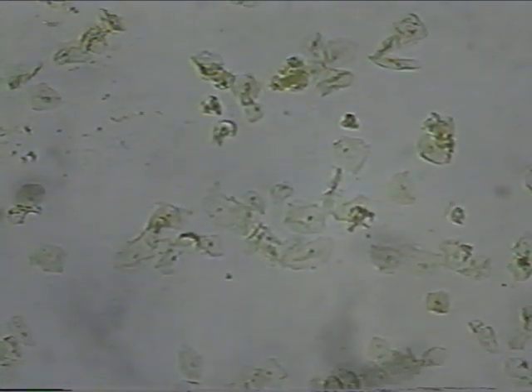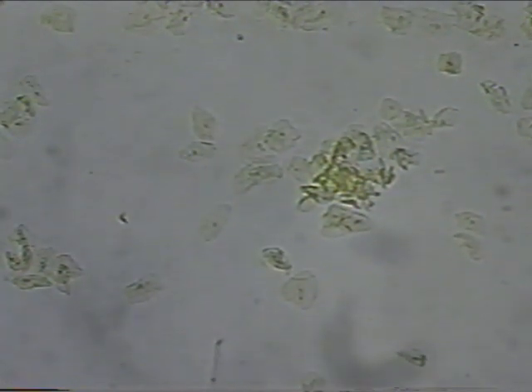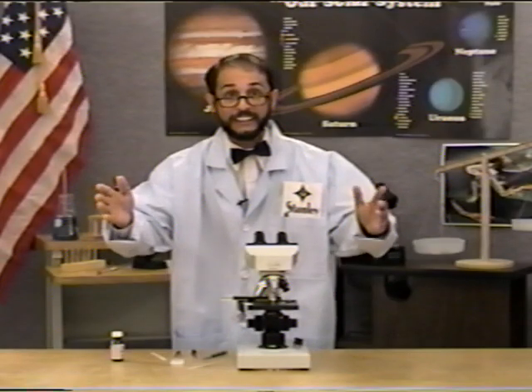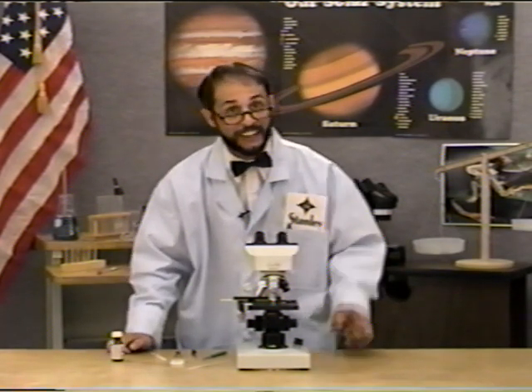You'll notice as we pan through the world of our little slide here, we see some good definition of individual cell parts. In this group of individual cells in the center of our screen right now, you'll see tiny dots that are nuclei. Also notice the individual cell membranes, slightly thicker areas around the edge of the cells. There are some more with their nuclei. Human cheek cells, a good thing for you to observe to learn more about cells and your body.